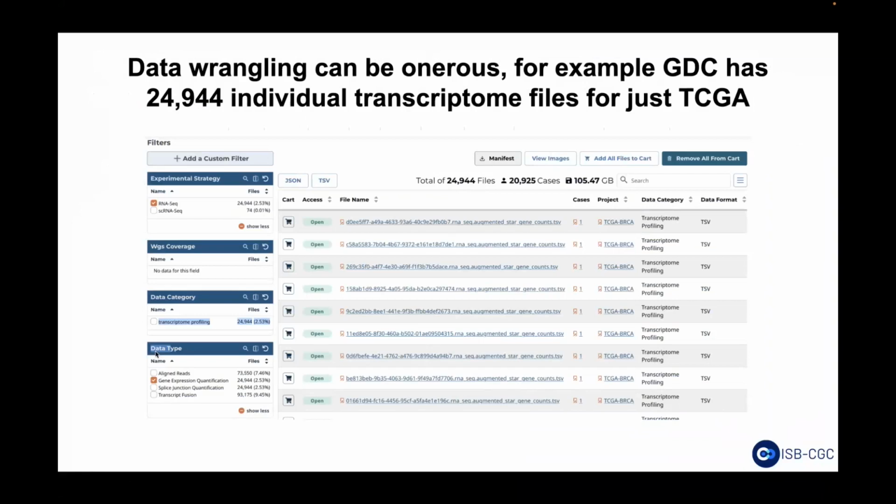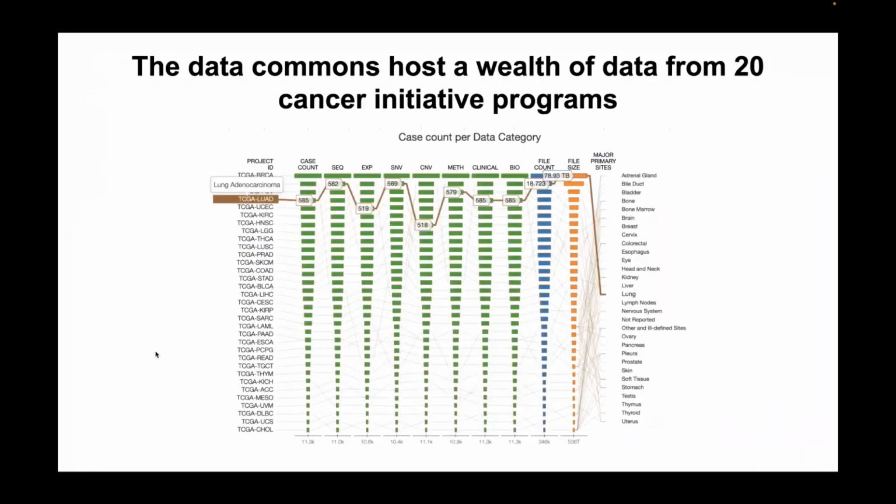You have to then combine them all, collate them into a single file, load them into R potentially, or into whatever data analysis tool you use, and then you can start doing your analysis. And so it's a little bit of a burden and a lot of effort for each individual researcher. So what we try to do is do that kind of work for the researcher.